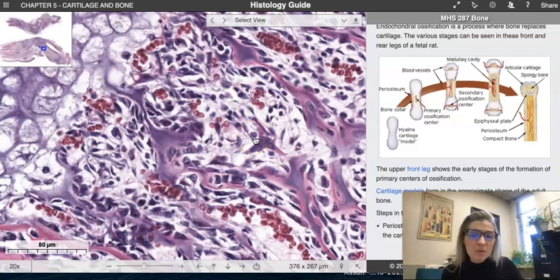We're starting to calcify this tissue. It's basically called calcified cartilage. We're not fully making this lamellar type of bone yet. Even spongy bone has a rolling lamellar foundation to it, but we don't see it as true osteons like we do with compact. That's going to start to happen.